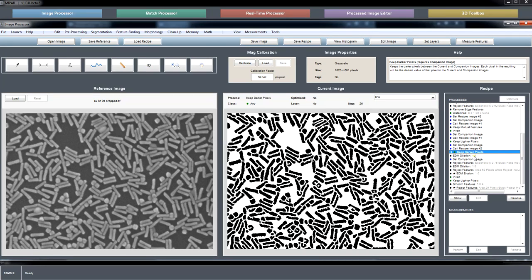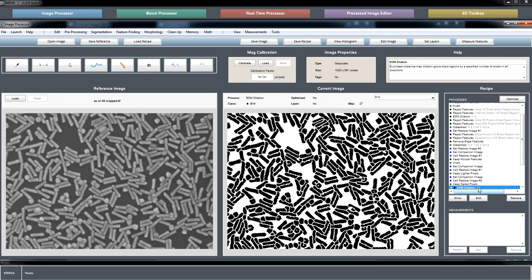And I am working to fix this snapping issue of the list box here with very long recipes. Every step that you click, you get set back to the bottom. It's not the friendliest, I know.